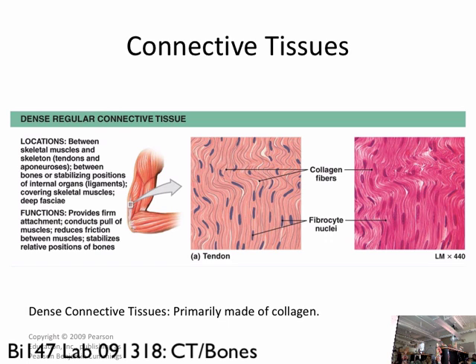Oh, that is because this is a super old kind of fat slide, and that was broken glass. So right here, centered right on some tendon. That's actually not a very good slide. What happened there is somebody did what I said. They pushed down on the thing and it cracked along all the edges. So that black and white pattern was the cracked glass. That's what happens. Yes, ma'am.